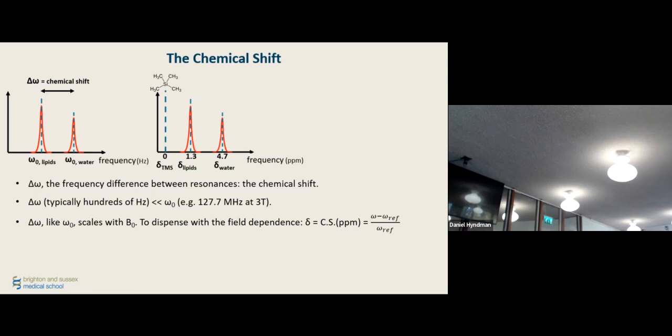And this molecule is called tetramethylsilane, and these are the protons that generate the resonance that is arbitrarily defined as chemical shift equals 0 parts per million, 0 ppm. That's our origin of the system of coordinates from which we measure.